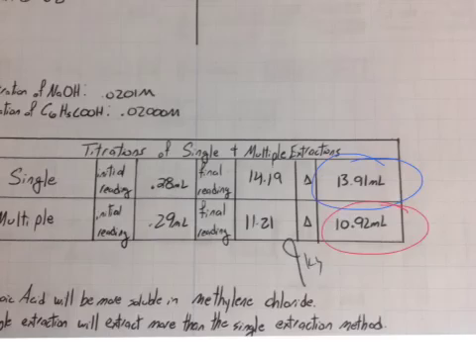To determine the amount of benzoic acid extracted, we first determined the initial amount of benzoic acid in the aqueous solution using stoichiometry, then determined the amount remaining through titration. When you subtract the two, the result is the amount of benzoic acid extracted by the methylene chloride.